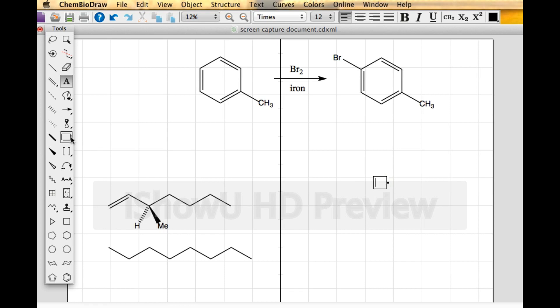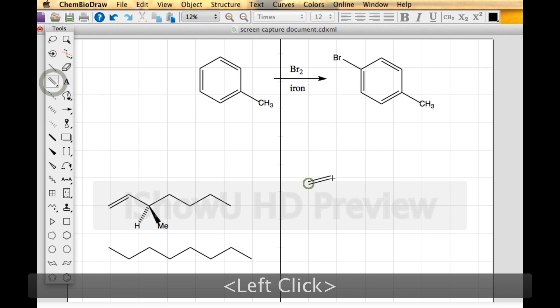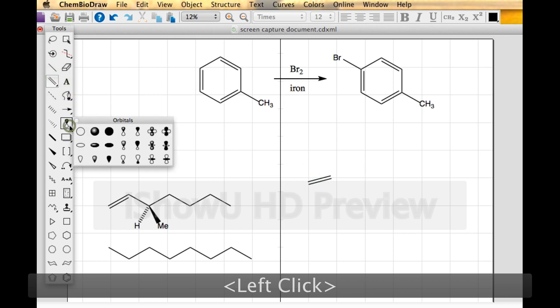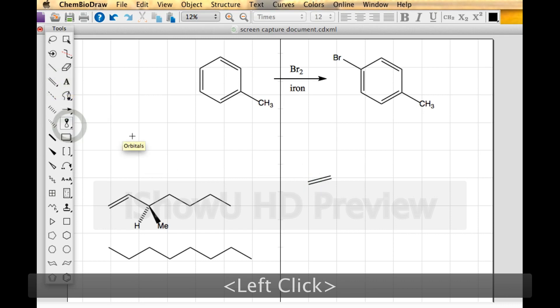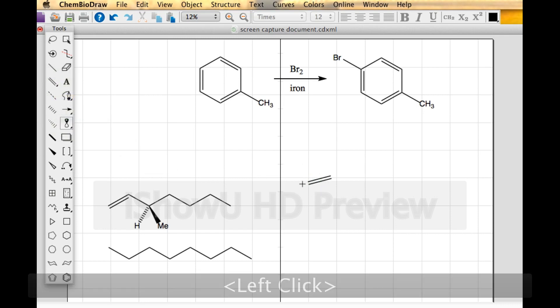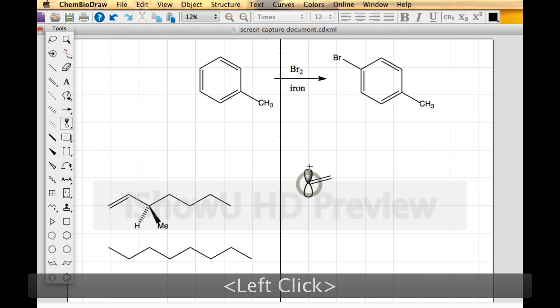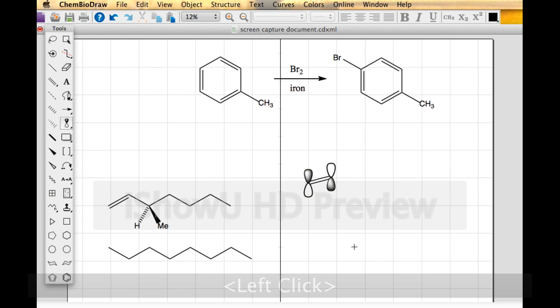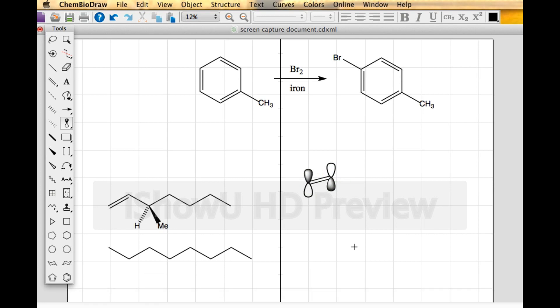Other tools you might find useful: draw a molecule of ethylene and you can draw the molecular orbitals. Then ask your friends — is that the highest occupied molecular orbital or the lowest unoccupied molecular orbital?